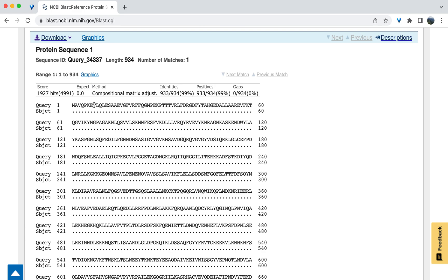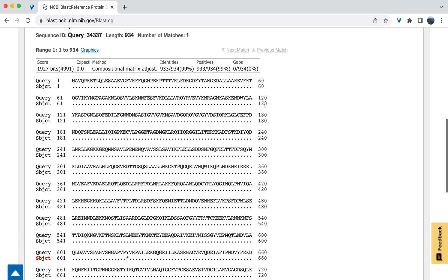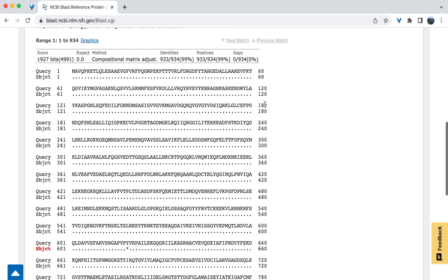The alignment starts at the first amino acid in the sequence, which in this case is M for methionine. At the start and end of each line, the amino acid number is listed. The amino acids that are the same between the two sequences are depicted as dots on the subject sequence.